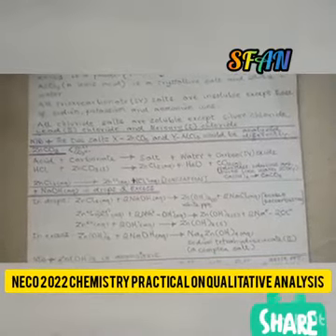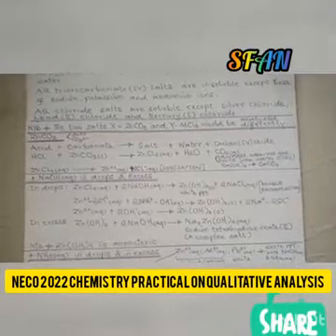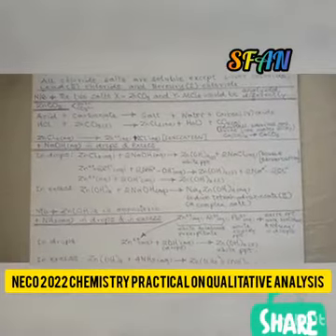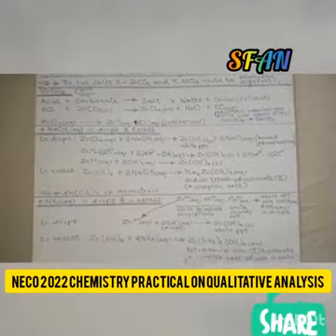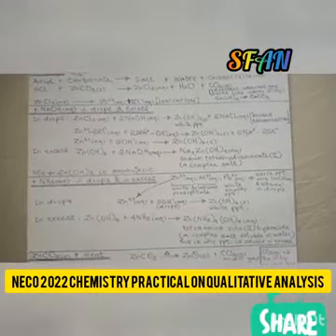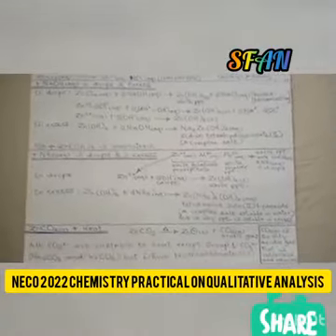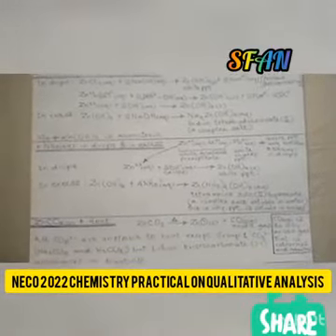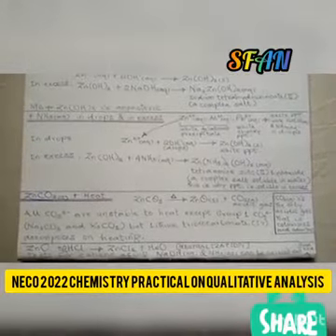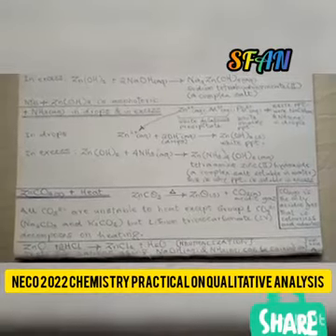All the reactions, when you add in drops, in excess, addition of HCl, addition of silver nitrate, everything has been written down here in a stepwise manner so that you don't need to cram, rather understand the chemistry of the reaction that is taking place.